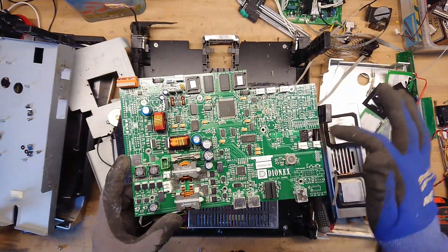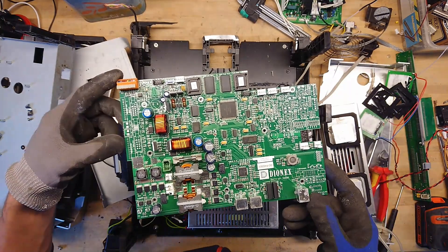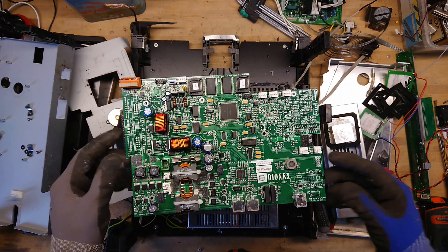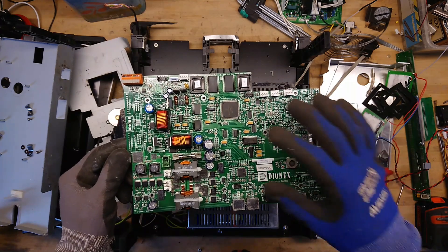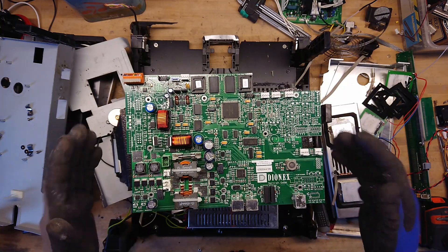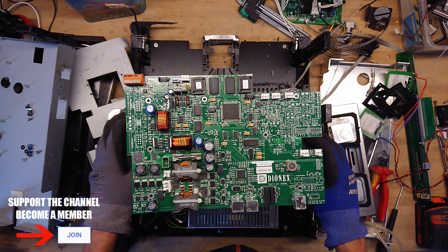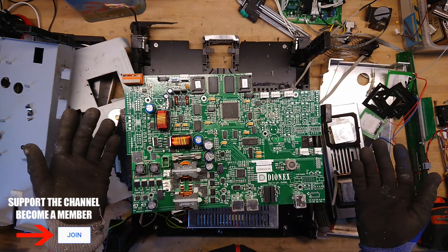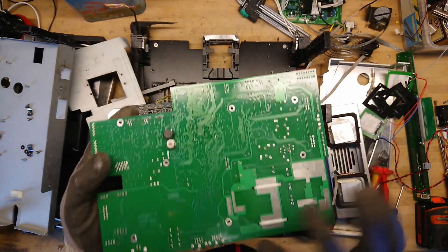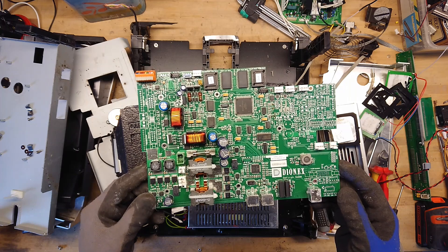We can also see that a whole part of the PCB is not populated, and the same goes for another area over here. This really suggests you have some kind of modular product where you can expand it with options — not on separate cards, but simply by how many components you populate on the main board for whichever version you sell. I hope you enjoyed this chaotic teardown. It was a bit disappointing and did not contain as many parts as I hoped, but at least we got to see what's inside a thermostated column used in a HPLC setup.